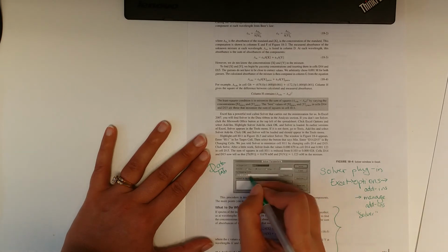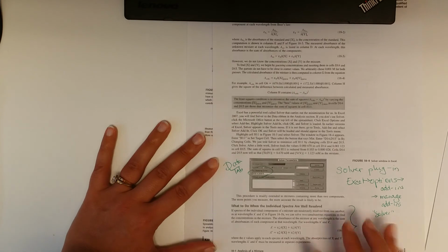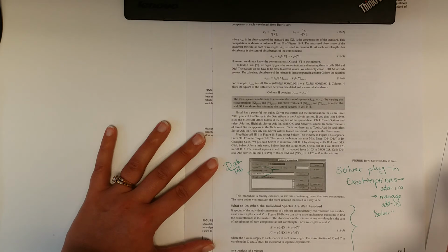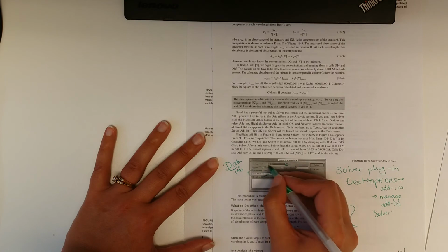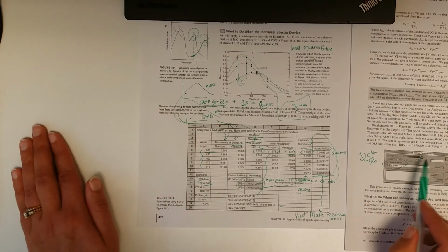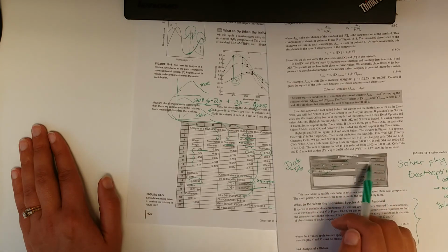But you'll say, by changing these cells, and you'll click on your two guesses, okay? By changing those cells, I want you to minimize, it says min, the value where? Well, I want you to minimize this value. So set the target cell. We want to minimize this sum of squares. So we say Solver, minimize that value by changing simultaneously both of these. And then we say solve.